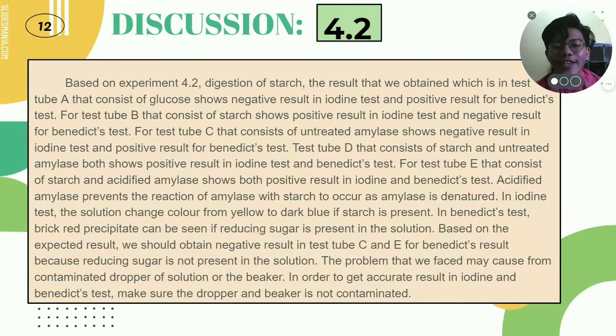So in order to get accurate results in the iodine and Benedict test, make sure the dropper and beaker are not contaminated. So that's all from me.